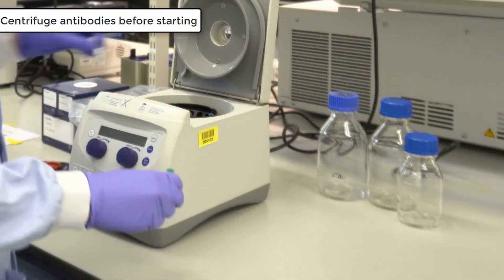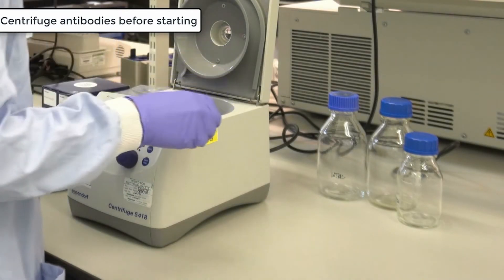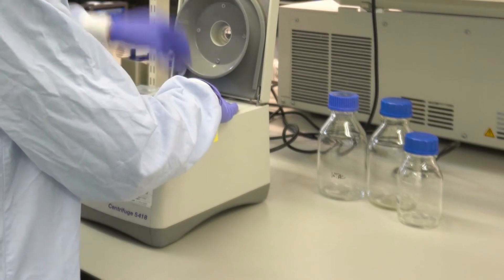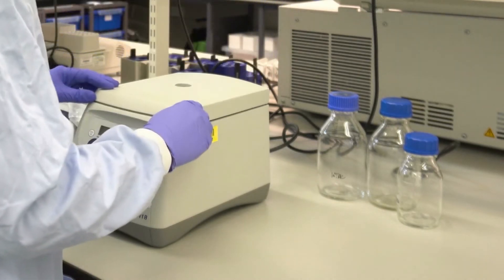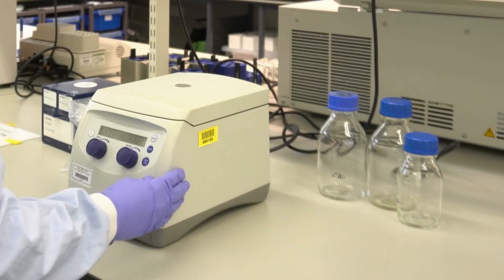To begin the live staining process, the first step is to centrifuge the dye-conjugated antibodies for two minutes at 2000 RCF. This is important to minimise the transfer of protein aggregates that may have formed during storage, which could potentially lead to non-specific background staining.